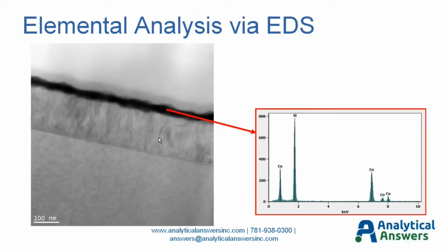If we look now at the polysilicon gate material, again, we have this dark material that's on the top. Point spectra EDX shows that to be cobalt silicide. Again, we see this small copper peak, which lends credence to that just coming from our copper support grid. You see the polycrystalline nature of the silicon here that's in the gate, and single crystal silicon beneath it obviously doesn't show that. And we have this thin layer between the two, which is the gate oxide used in this MOS transistor.